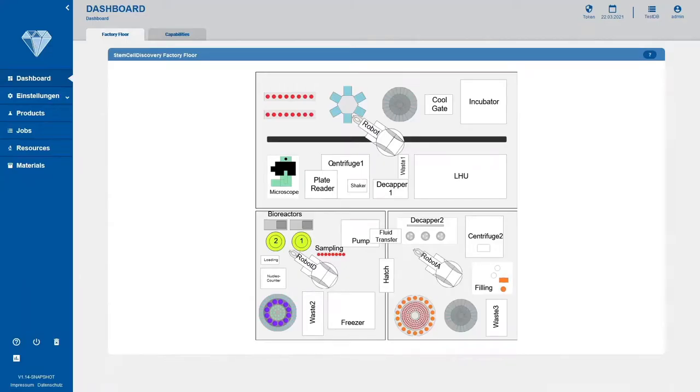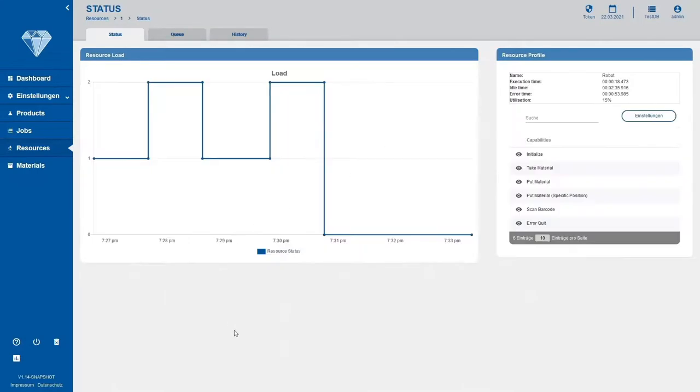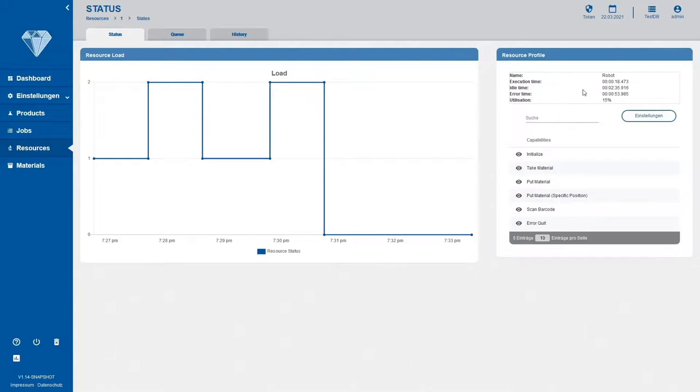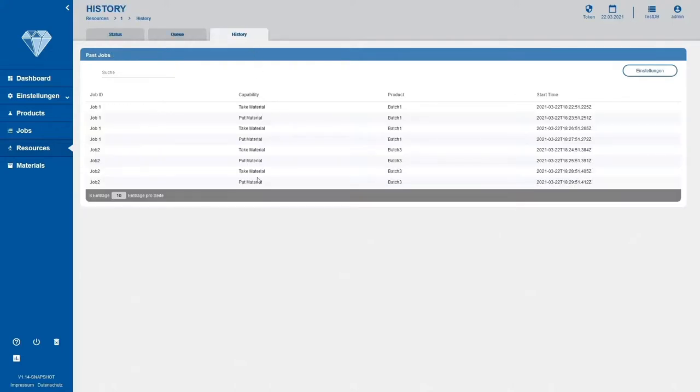First up is the dashboard with a graphical navigation component, which can be used to access resource detailed pages, such as the robot page in this case. The resource details page contains a resource load graph with status 2 signaling a resource is busy, 1 idle and 0 in error, and a resource profile with the name, the logger data and a utilization as well as a list of capabilities. Furthermore, there are lists for queues, for capabilities that are to be executed and capabilities that have been executed in the past.